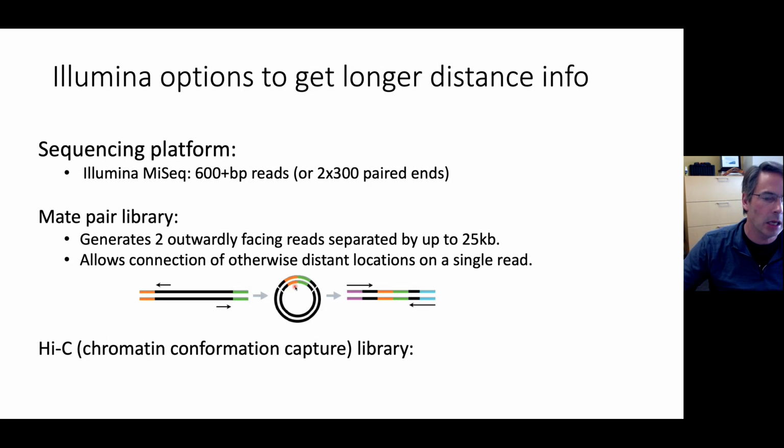In this case, you have a really big insert from your DNA that's represented by the black chunk there, and then you ligate adapters onto the end.